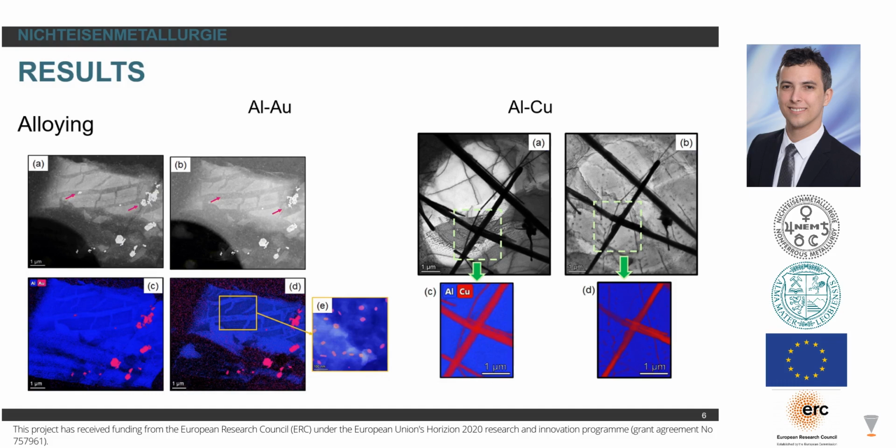We didn't know, however, whether these plates had drifted away because the aluminum melted and pushed the particles apart. Therefore, for both cases, we need to do a heat treatment to be sure that we can make new phases out of this resulting specimen. So we then go to heat treatment.